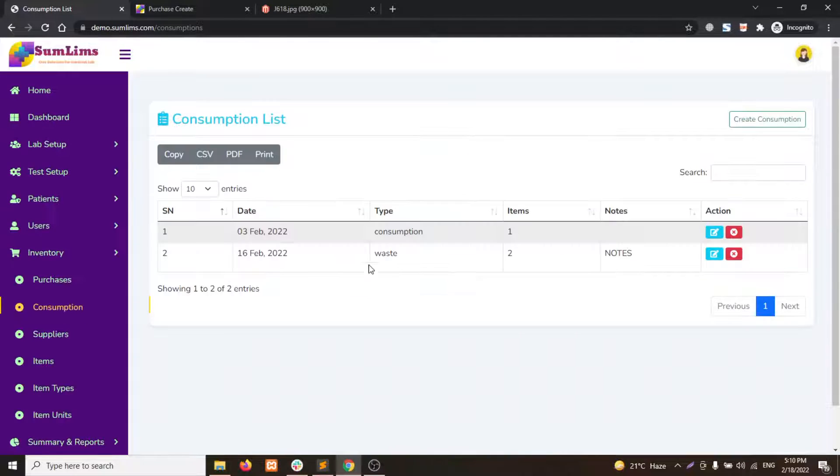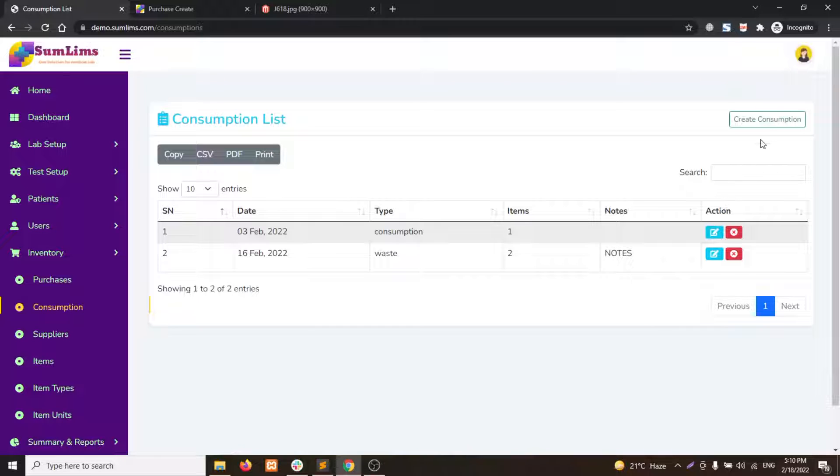Once the page is loaded, you can see all the consumption or wastages. To create a new consumption, click on the create consumption button.